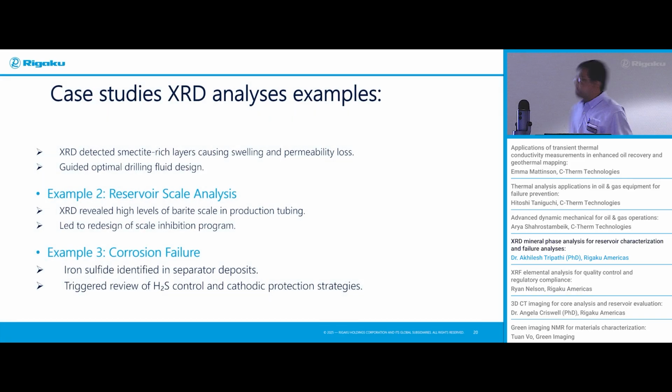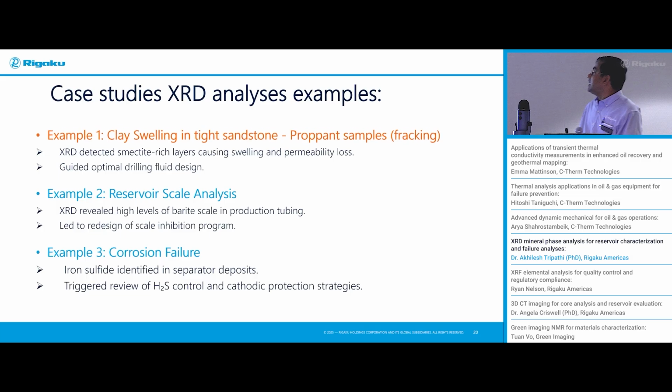So this one is, I'll bring this. Clay swelling in tight sandstone. Proppant samples, which is what I'll go into describing, is used in fracking. So XRD detects smectite-rich clays causing swelling and permeability losses in case of fracking. Guided optimal drilling fluid design, that's the goal.